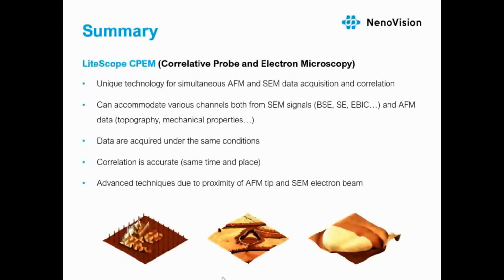Lastly, the conductive CPEM clearly showed a measurement mode, which takes full advantage of the AFM tip and electron beam proximity, and it's obvious that there are way more applications where this setting will enable many more unique and unforeseen measurements.